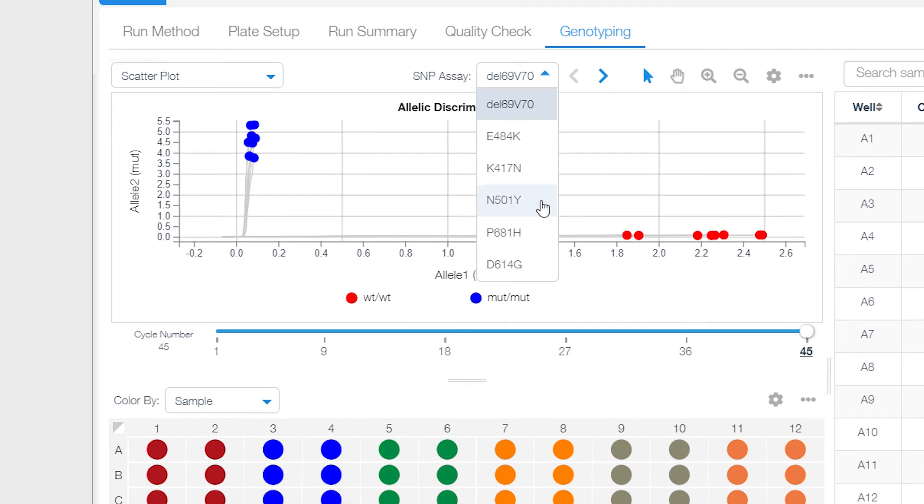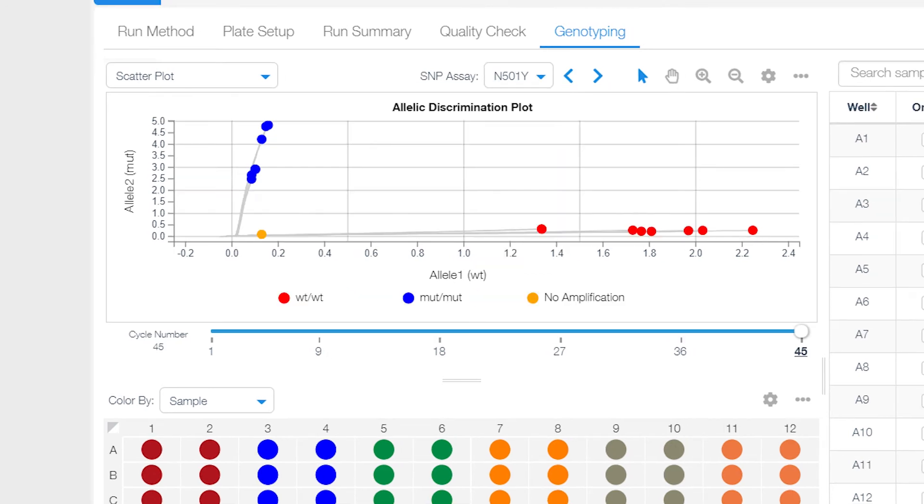What you see here is very clear discrimination in the cluster plot between the wild-type samples and the mutation samples.